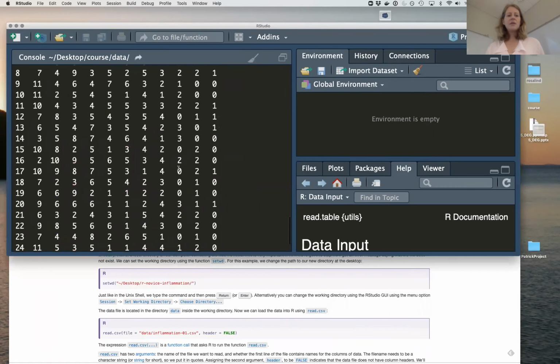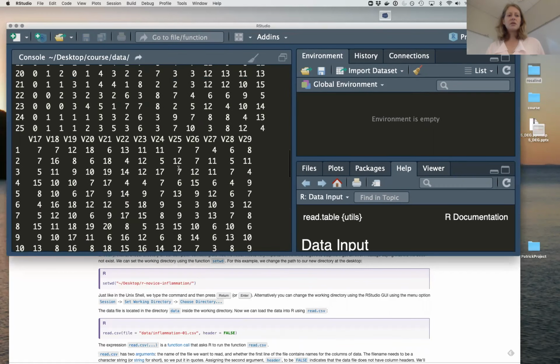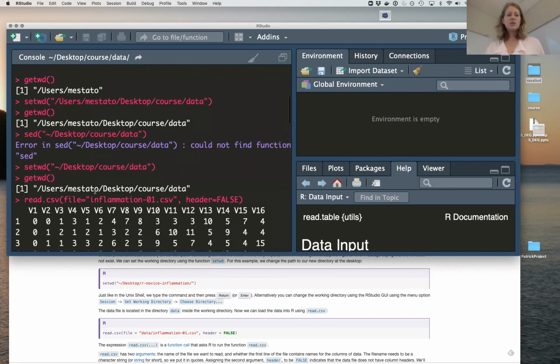So if you type that command, and I'll scroll up so you can see it, you should see a bunch of data scroll across your screen. That's the command, which I think highlighting it makes it harder to read. So I'm not going to do that.